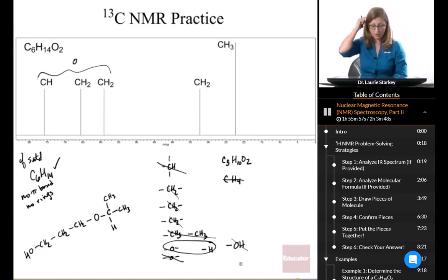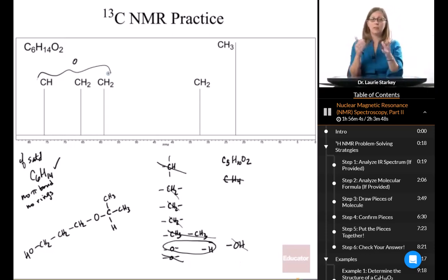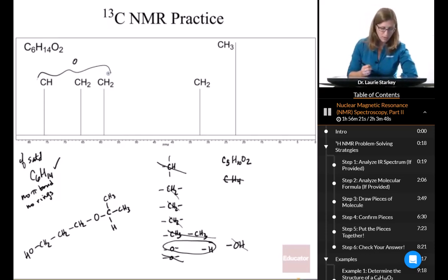So the trickiest part here is that this also accounts for the chemical shift. We can't use coupling, we can't use those splitting patterns anymore to decide who is attached to whom. We can only use chemical shifts when we have a significant functional group that alters that. So really C-13 is very difficult for putting a molecule together, except in certain circumstances like this, where we can do a pretty good job. So before we leave, let's just double check: if you had to predict what the C-13 NMR would look like for this.